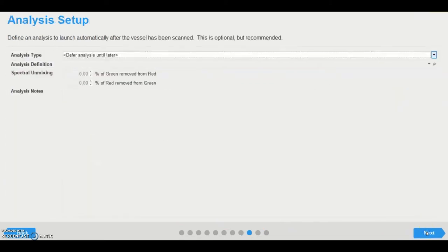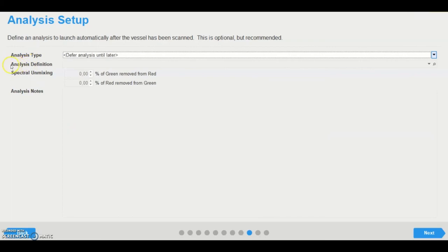Once assays and analyses have been run multiple times and are established, it is possible to launch analysis in conjunction with image acquisition. The appropriate analysis type is selected, allowing the selection of the desired analysis definition. Spectral unmixing values, having been determined previously, are then inputted along with any notes. If the assay has not been performed previously, then it is recommended to defer the analysis until later and run it post-acquisition.